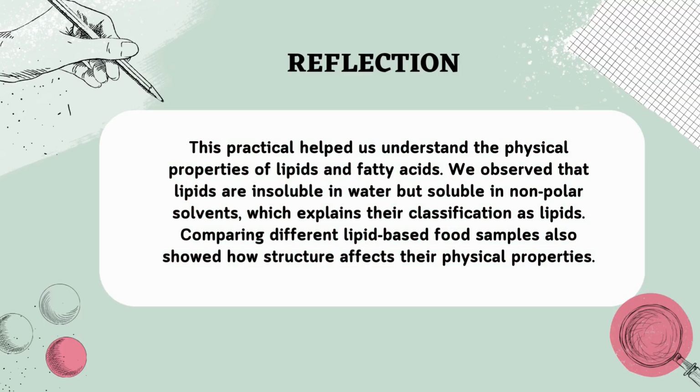For reflection, this practical helped us understand the physical properties of lipids and fatty acids. We observed that lipids are insoluble in water but soluble in non-polar solvents, which explains their classification as lipids. Comparing different lipid-based food samples also shows how structure affects their physical properties.